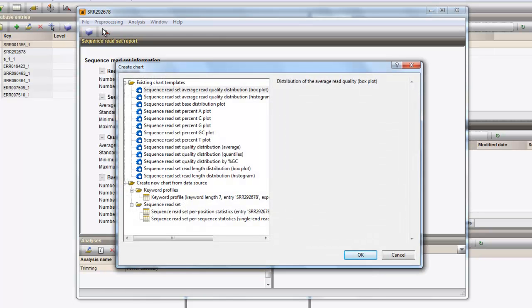Here you can learn more about the average read quality distribution, the base distribution, the read length distribution, etc. Any of the dedicated charts will automatically be created based upon the read information present in the Sequence Read Set at hand.